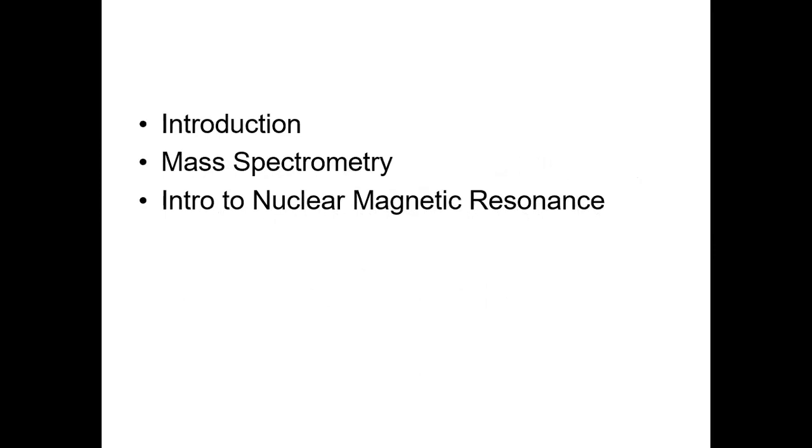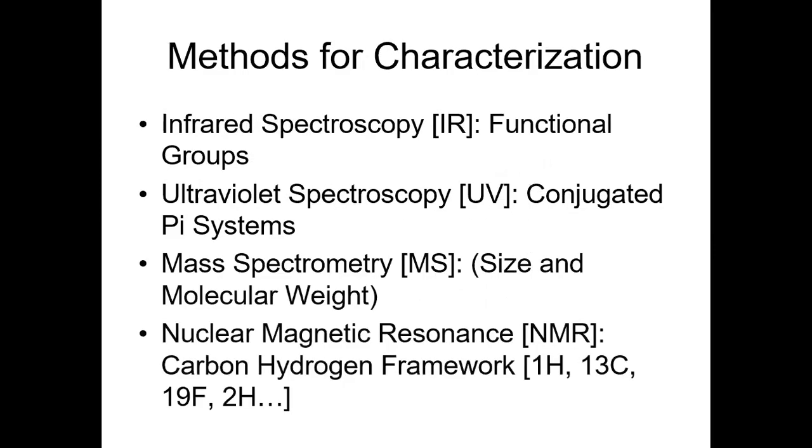And so when we talk about characterization techniques, we just talk about ways to determine the identity of whatever you synthesized. Right? We talked all semester about making stuff. We talked about how to make alkyl halides. We talked about how to use them in substitution and elimination reactions, how to couple them with other alkyl halides. We talked about conjugated dienes and making Diels-Alder products and all of this stuff. And so all of those things, you don't just simply make them and run a reaction, go to lunch, come back, and then start using it, right? Everything you make in a lab has to be verified. And so all of these techniques are verification techniques. These are ways to prove that you made what you claim to have made.